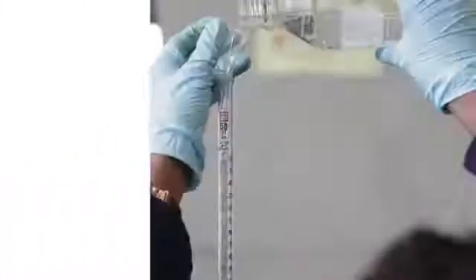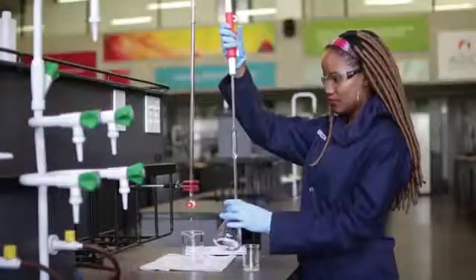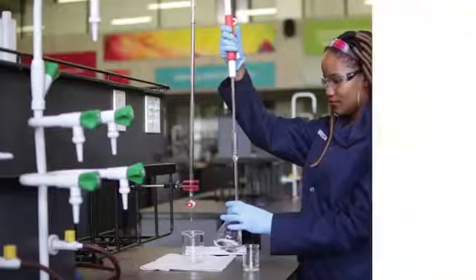The burette will then be refilled. Initial readings recorded and the solution in the conical flasks prepared in preparation for the next titration.